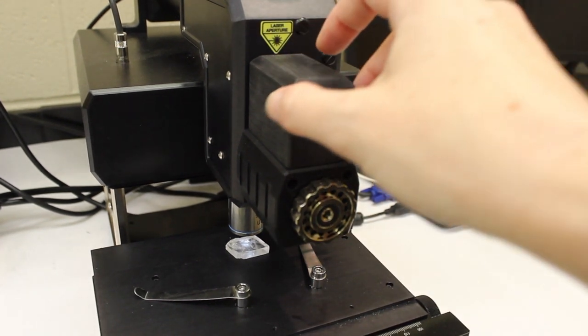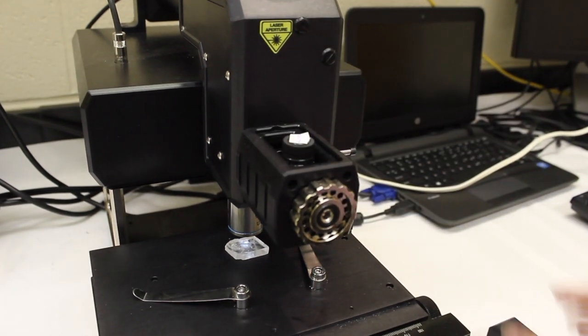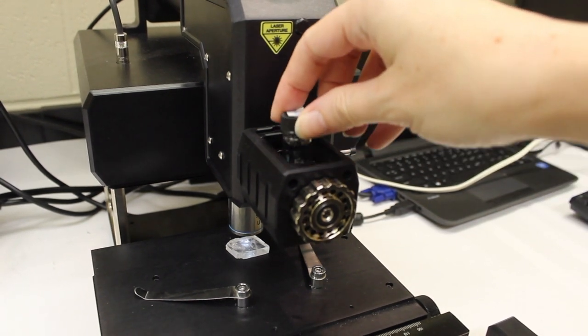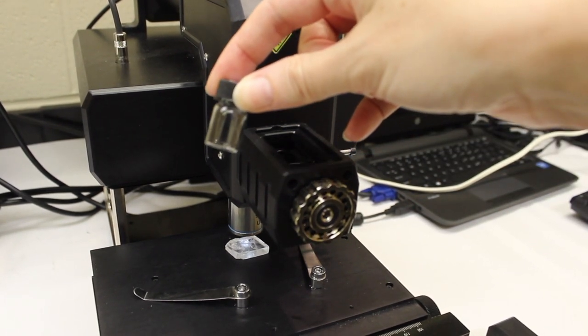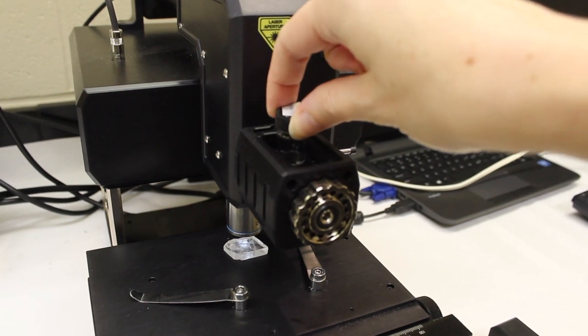If you have a liquid sample, you can put it in this top compartment. You simply fill one of the glass vials like this with the liquid and insert it into the spectrometer.